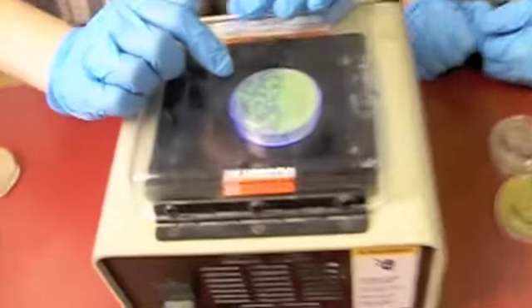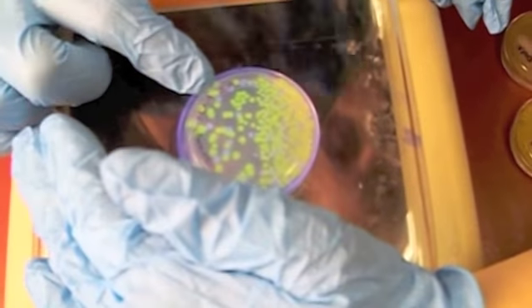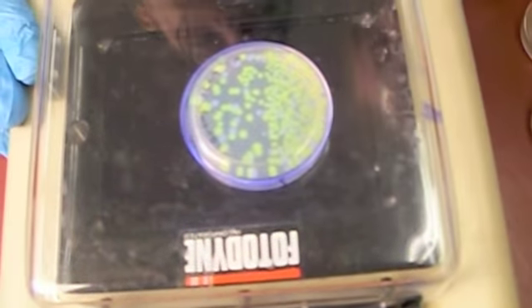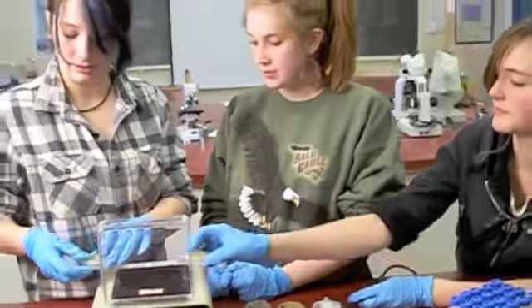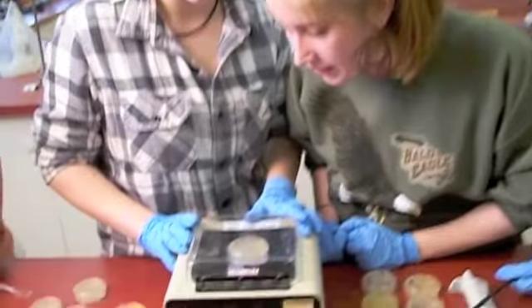This one has 2 different colors. It has a plasmid that codes for blue fluorescence and a plasmid that codes for green fluorescence, which is pretty cool. You can see really clearly the difference between the 2, even though the green shines brighter. That's how we know that the plasmid was picked up. Also because it's alive, mainly.